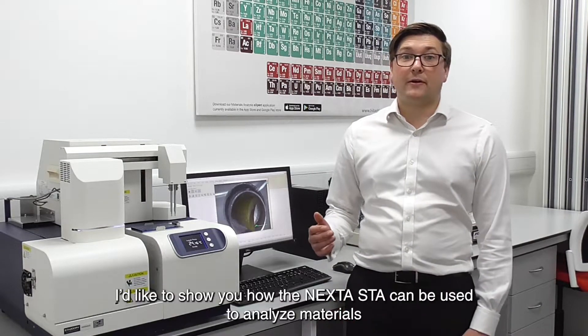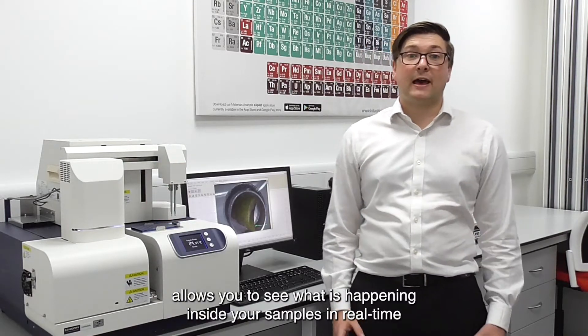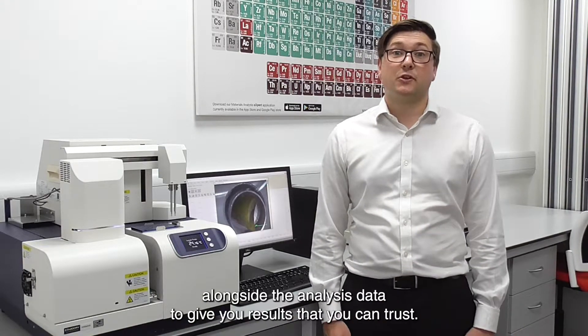I'd like to show you how the NEXTA STA can be used to analyse materials, and how our unique real view camera allows you to see what is happening inside your sample in real time alongside the analysis data, to give you results that you can trust.